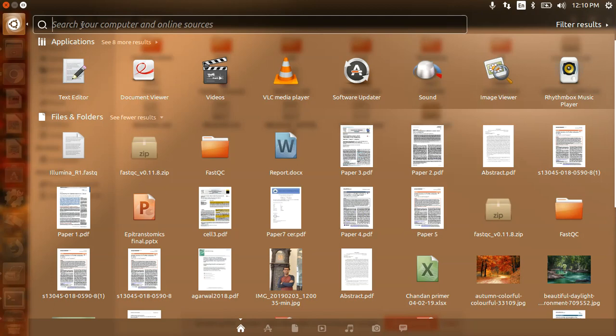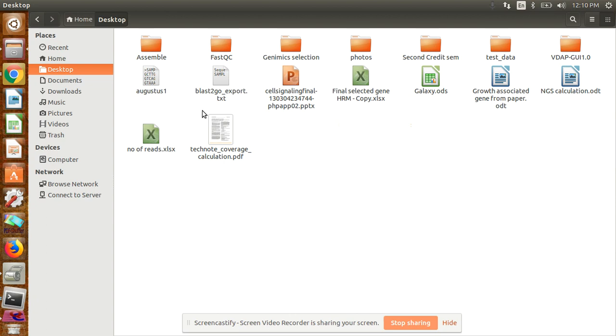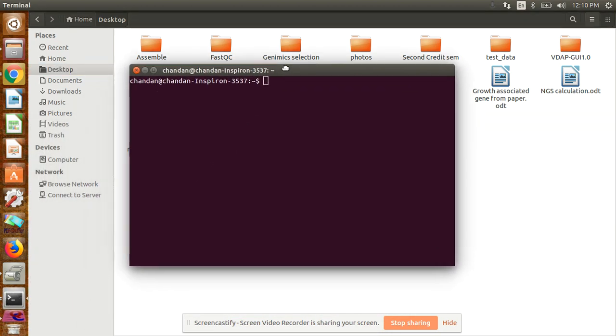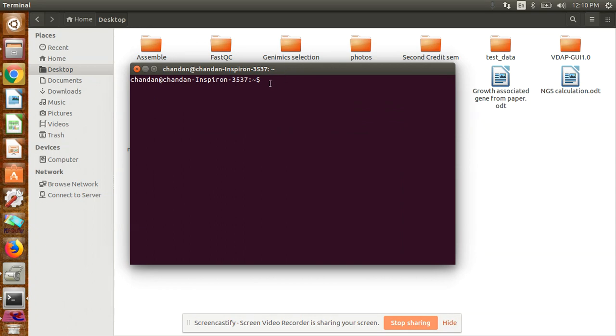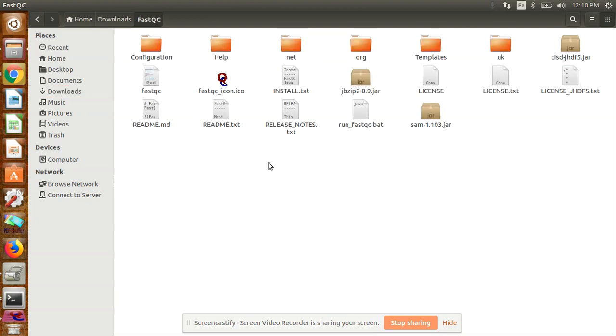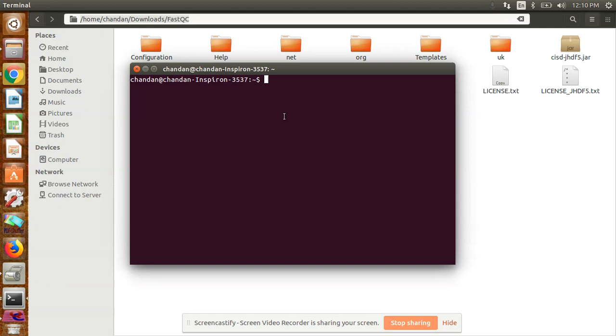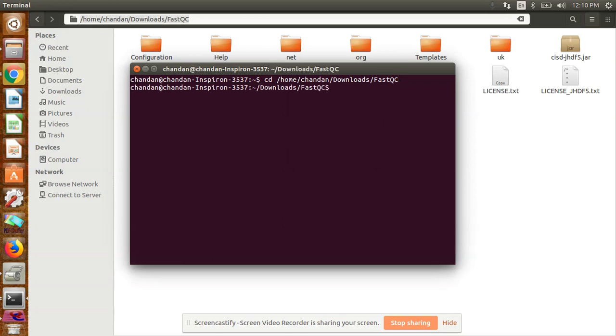Search for terminal. Those who use Linux know how to operate terminal. This FastQC can also be used in Windows, which I'll teach in later videos. Open terminal, then you have to go to the FastQC directory. For that, copy the path—Ctrl+L, then Ctrl+C to copy the path.